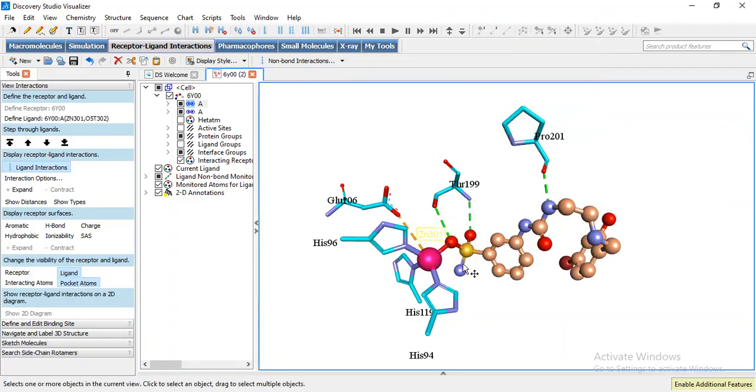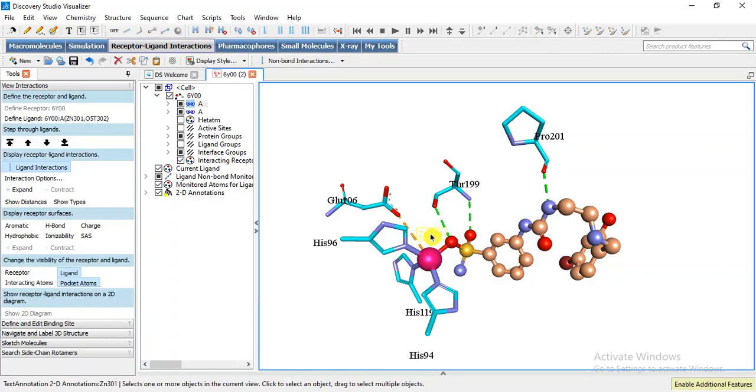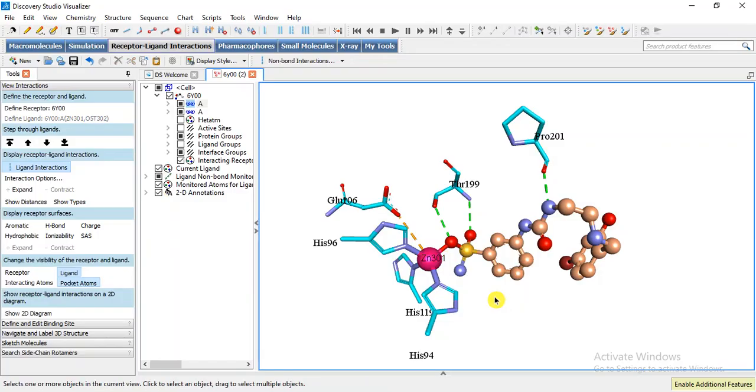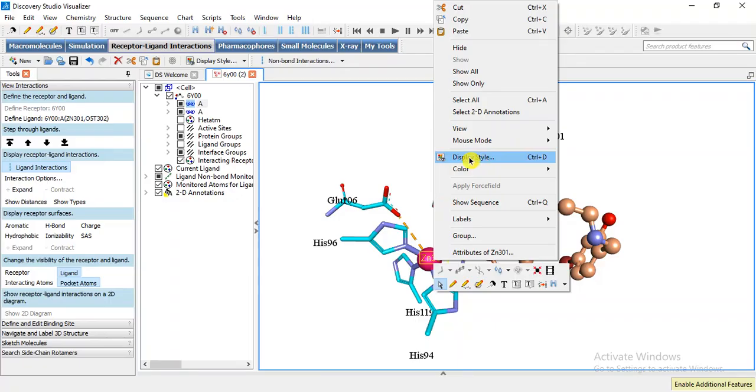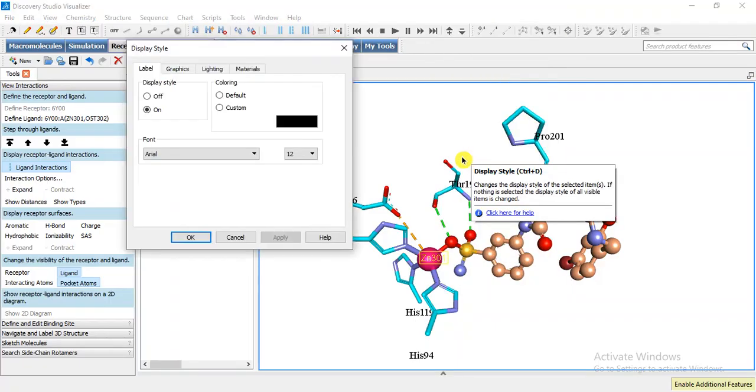We can change the style. I want to change the style display style Times New Roman.